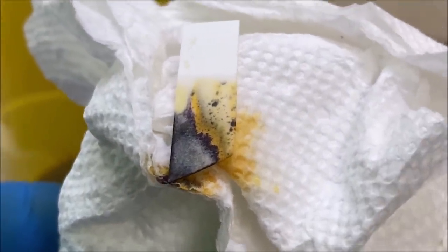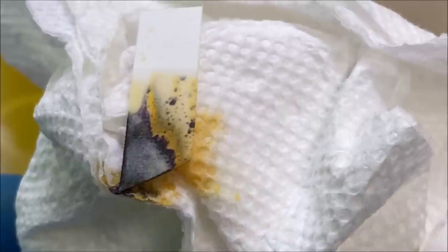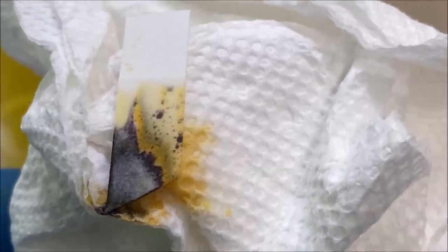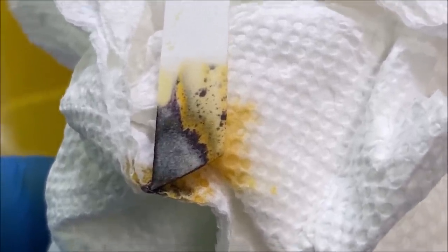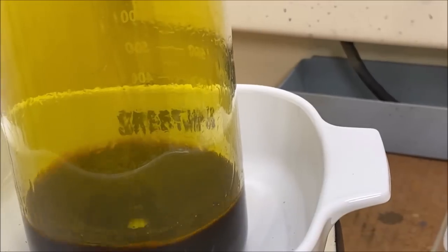I just did another stannous chloride test, and you can see there's some orange, which indicates platinum. I see some outlines of green, which means palladium, and that real dark stain is probably gold in solution. So we got gold, platinum, and palladium in our solution.